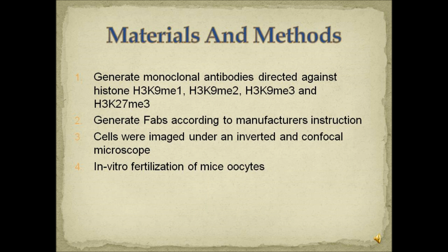The first step was to generate monoclonal antibodies, MABs. Mice were immunized with synthetic peptide. After generating hybridomas, the clones were screened, isotyped using a kit, and purified. The resulting clones were then measured to determine the affinity of the MAB.